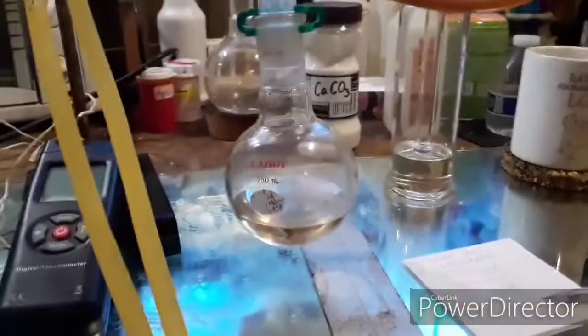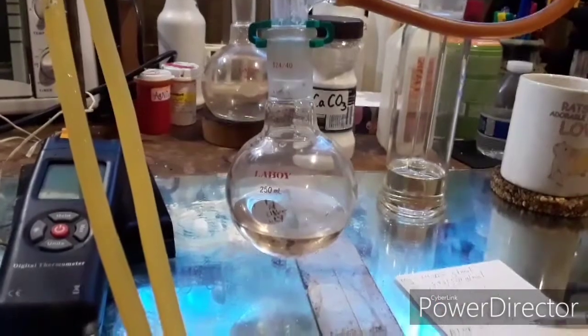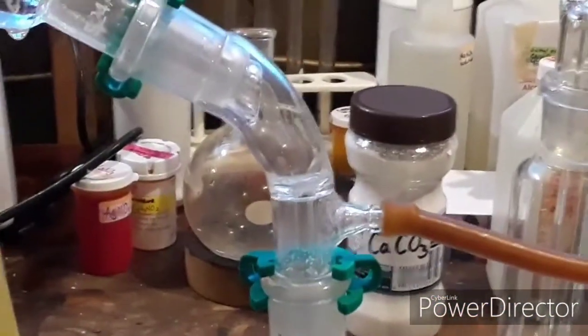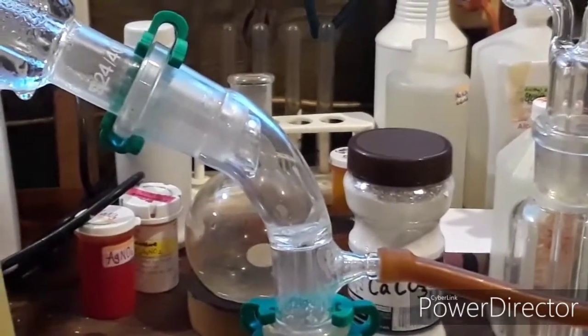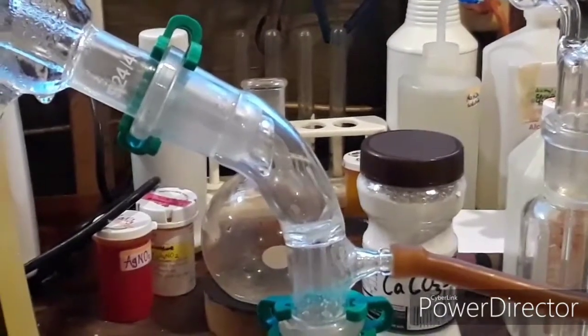I switched out my receiving flask once it stopped distilling over at that temperature. I've been collecting sulfuric acid now for about an hour and a half, and as you can see it's not the fastest distillation. If I had put a flame underneath instead of my heating mantle, I'm sure this would go a lot faster.